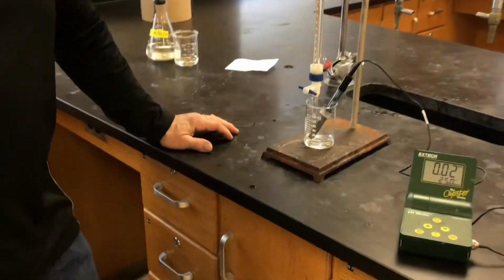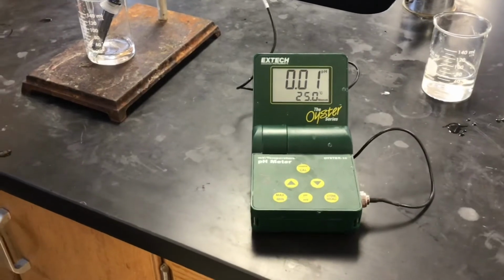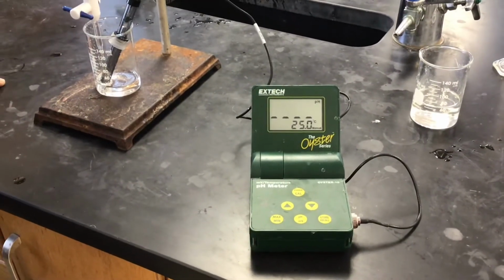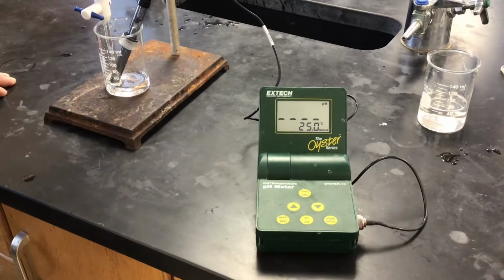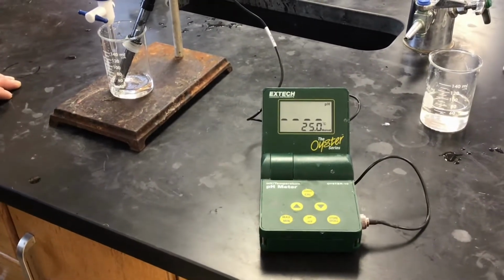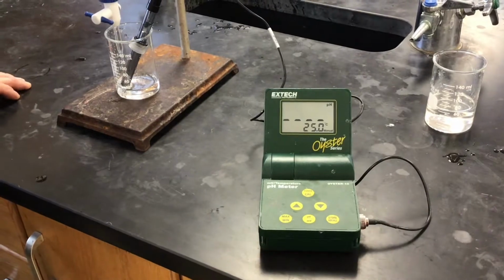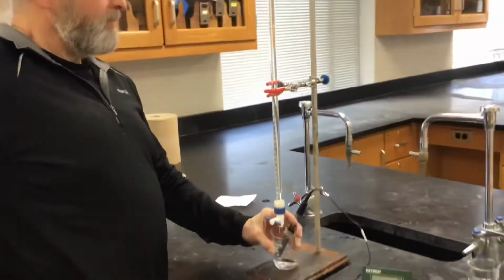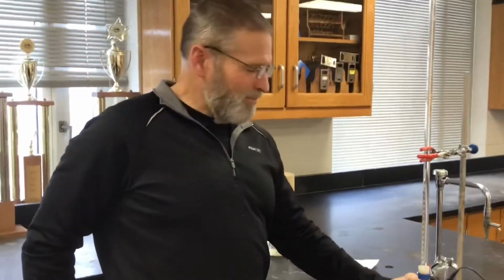We have the pH meter now in that sample, and there's that pH. Look at that. Oh, whoops. Well, let's assume that it was 0.00. It was reading that, and then I guess it doesn't like to go into the negatives.